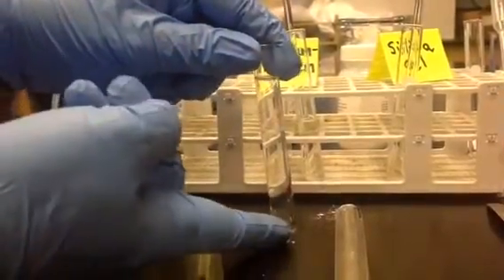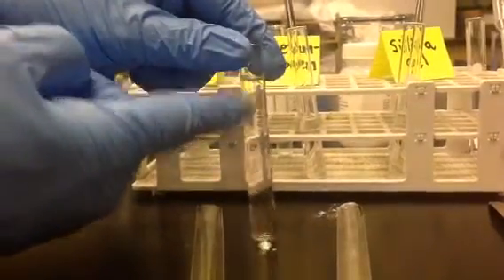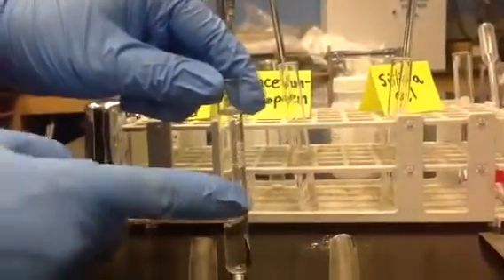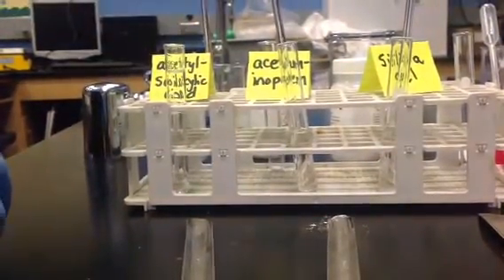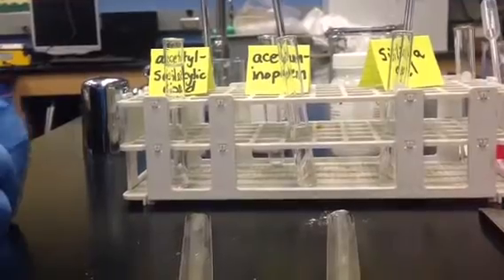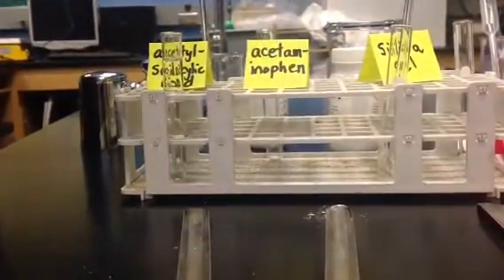And definitely the larger volume is at the bottom, and we added way more water than ethyl acetate. So definitely water is the more dense layer. So ethyl acetate and water are not soluble, they're immiscible, and water is more dense than ethyl acetate.